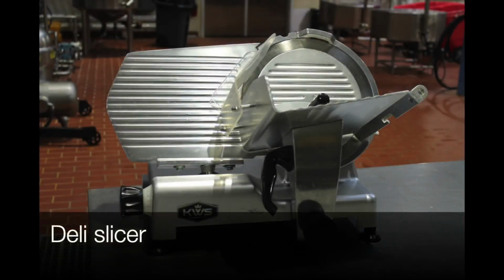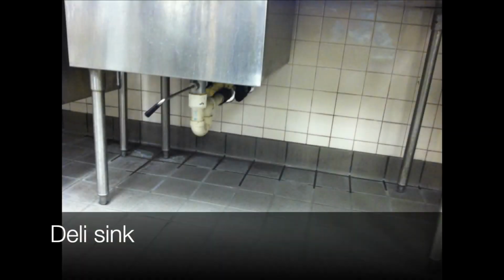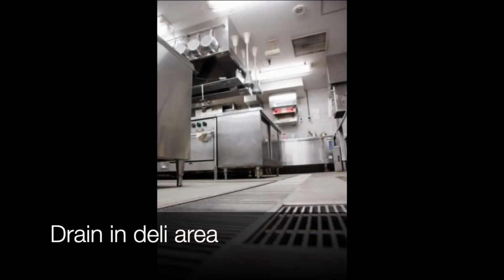Floor wall juncture under deli case. Deli slicer. During cleaning and sanitation procedures, this piece of equipment might be partially disassembled at best, leaving room for residue to accumulate in deeper parts of the equipment that are never reached by cleaners or sanitizers if not taken apart properly. Deli sink interior and exterior. Drain in deli area.